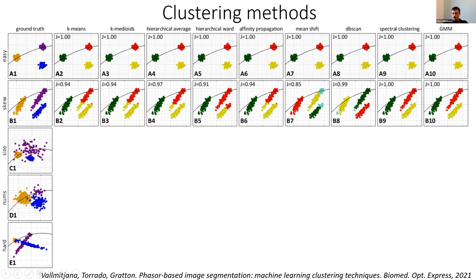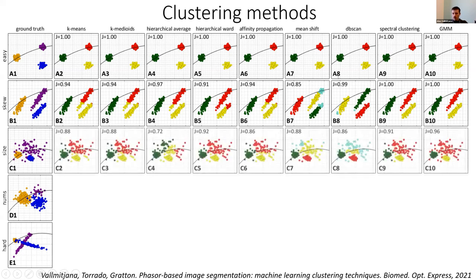Other cases in which they're failing, well, the ones that are based on density: if you have isolated points, they kind of drop off. They're assigned to an outlier group. This is one of the good things about these methods, though, that they allow for outlier points in your data, whereas the traditional ones don't. You simply say, okay, if it's 3 clusters, it's 3 clusters.